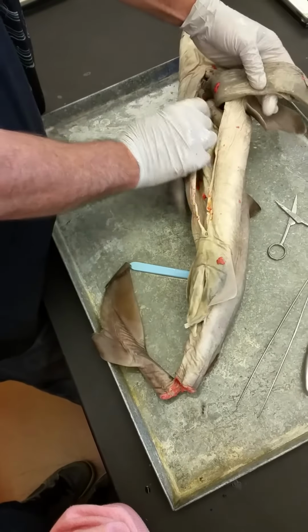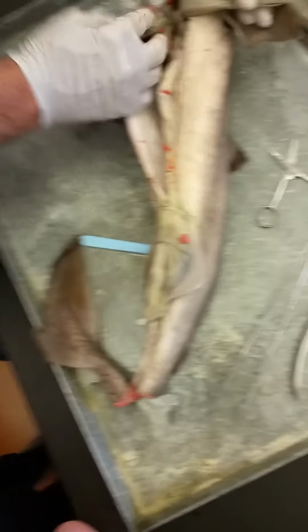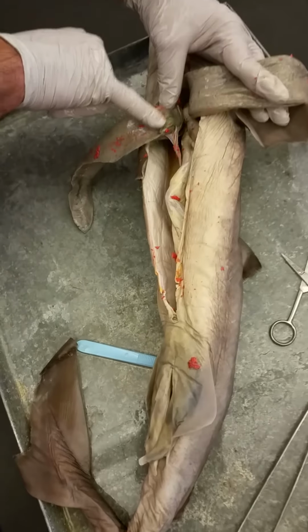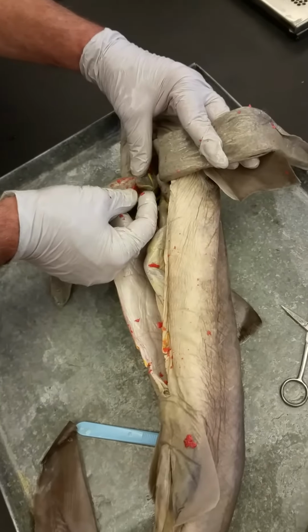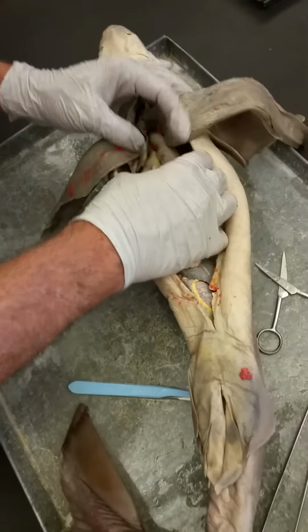Okay, so liver, huge organ. The liver makes bile salts, like we talked about in the mammalian digestive system, and secretes those with the gallbladder. Here's the gallbladder on the underside, kind of bright green there. Okay, so we get the liver out of the way.